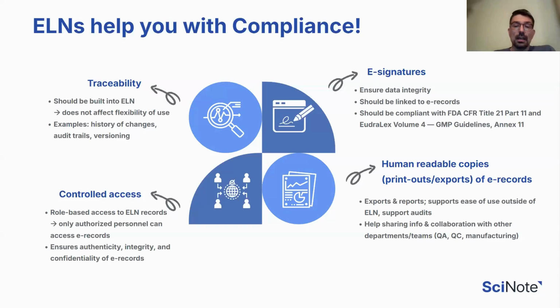Electronic signatures have to be in place to ensure data integrity, and they should typically be compliant with standards or regulations, guidelines by either FDA or Annex 11, that's a European counterpart. And lastly, it might be obvious that compliance usually requires the electronic or the digital platforms to have human readable copies of them.